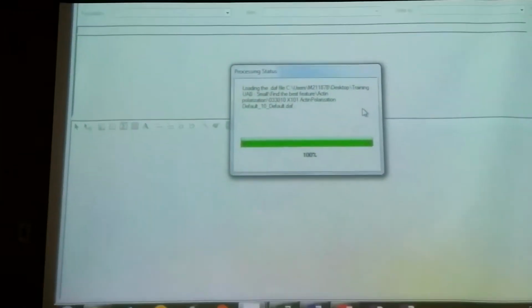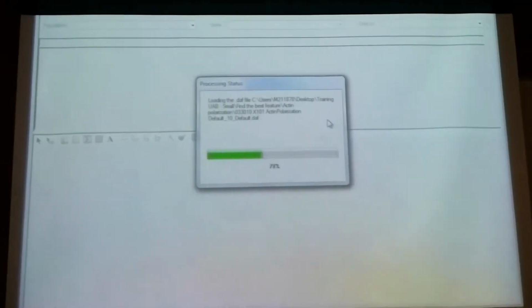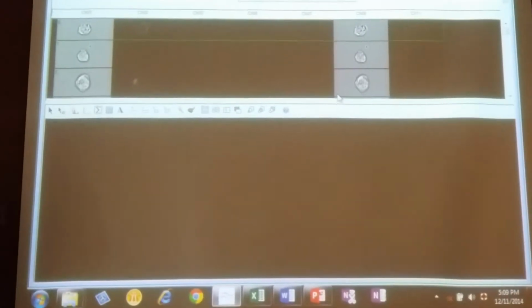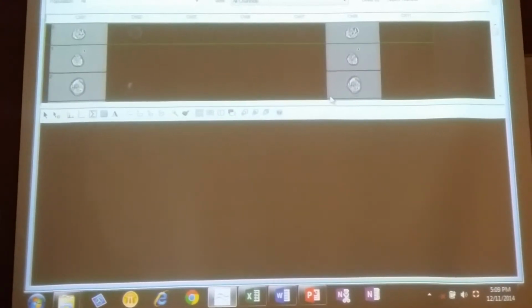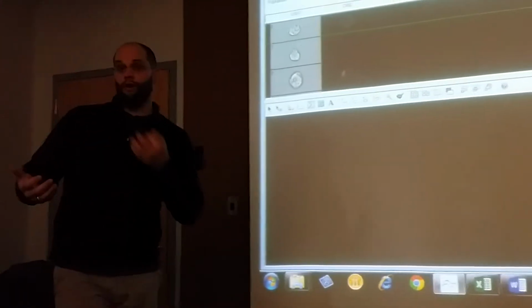So this shouldn't have any features created whenever it loads. Okay? So I want you to watch me. If someone gave me this data set and they were to say, I want to look at shape change and I want to look at actin polarization and determine which cells have actin polarized or not, we just show you that it doesn't have to take that long.